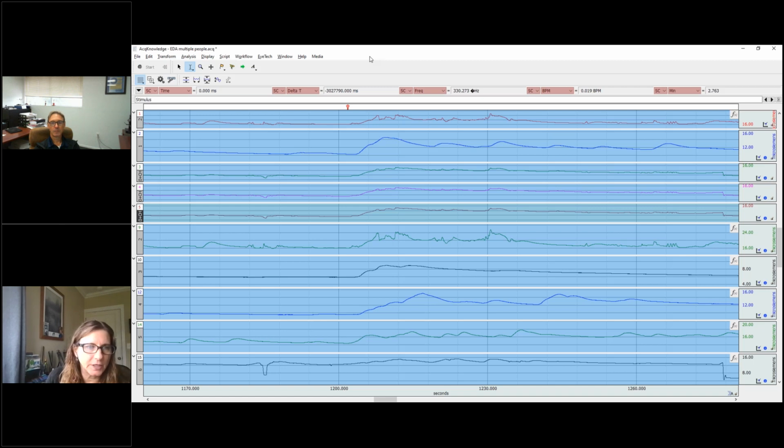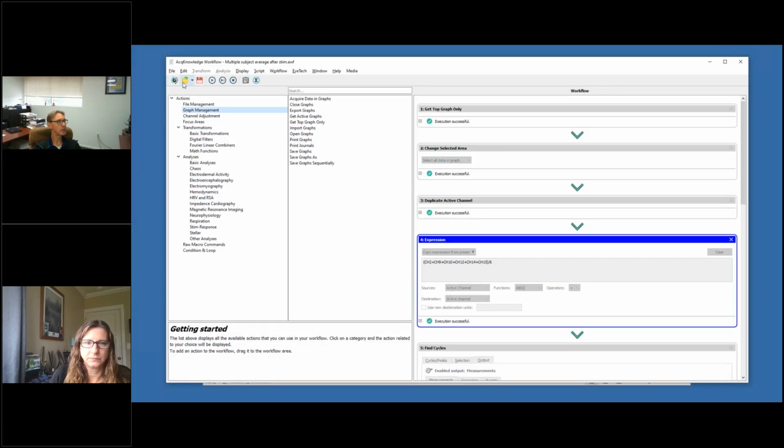Okay, then while you're here, someone asked, you mentioned 3 files as an example. What's the maximum number of files a workflow can open? In theory, I don't believe there really is a maximum. What I found though, dependent upon the type of analysis you're performing, it just takes a long time to run them all. One of the things that I didn't show, if you can bear with me, I can give you an example of how this works.